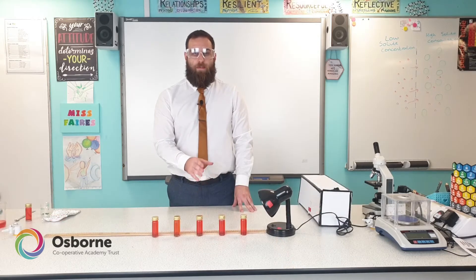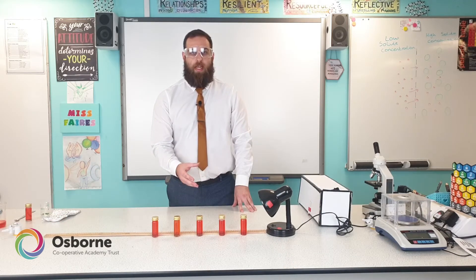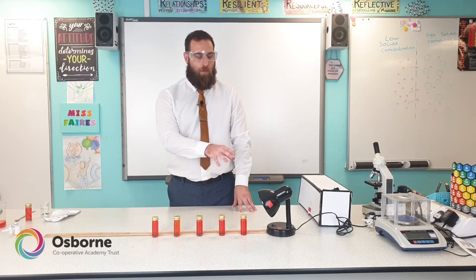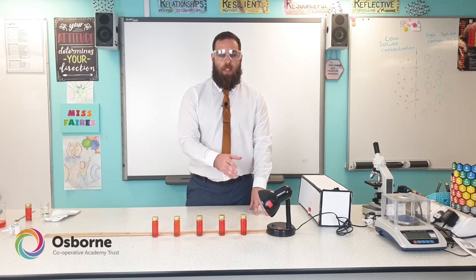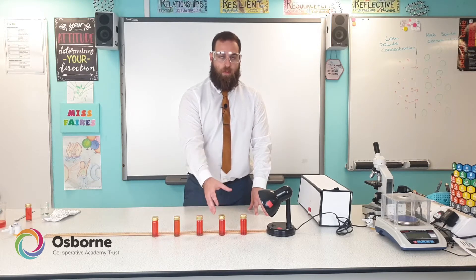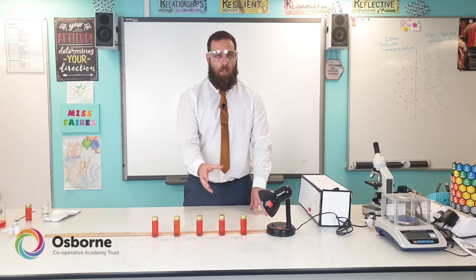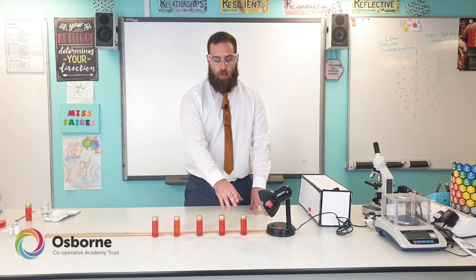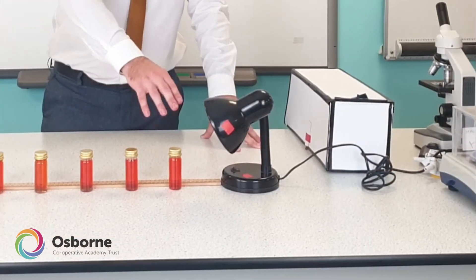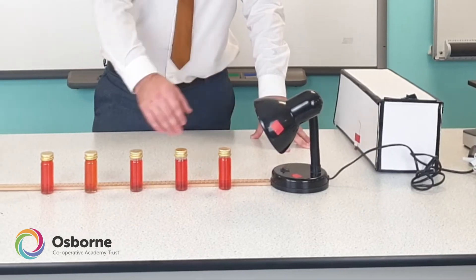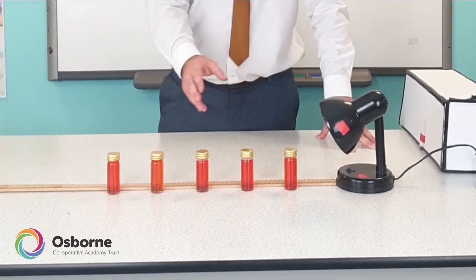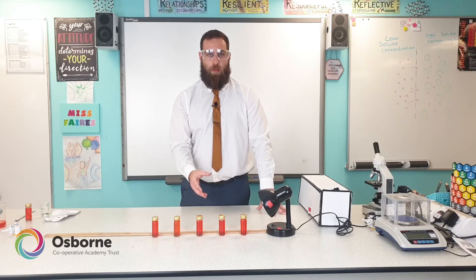We've now made four more Bijou bottles with indicator and 20 algal balls each. They're placed at equal distances away from our lamp — we're using 10 centimetres between each bottle. The Bijou bottle at the front will be exposed to more light than the one at the back, giving us a range of light intensities. Now we're almost ready to start — we've got a few more things to do.